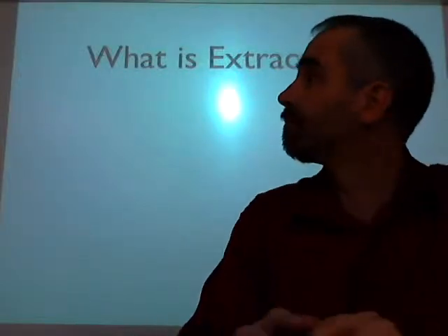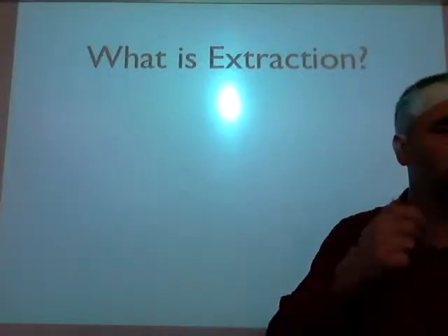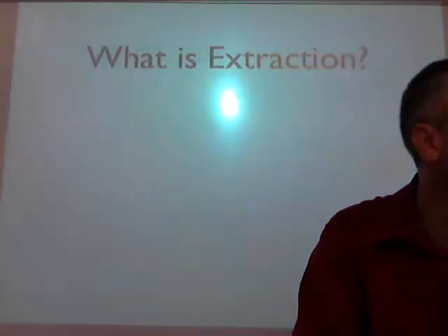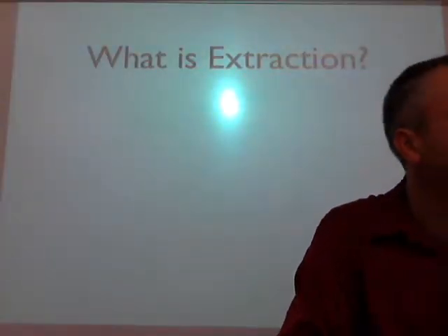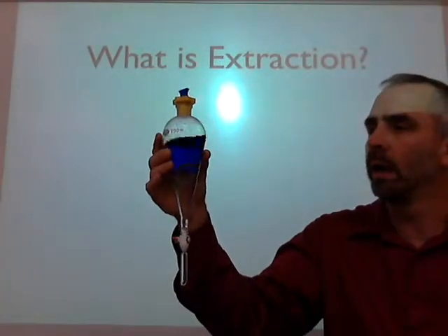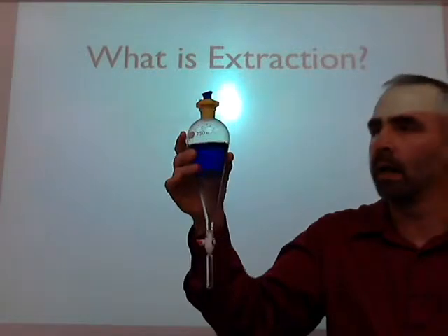All right. The next type of separation technique is going to be extraction. Turn that light on for a second. All right. You're going to use a separatory funnel. And I'll show you how this thing works. Right now it has a dye in it.